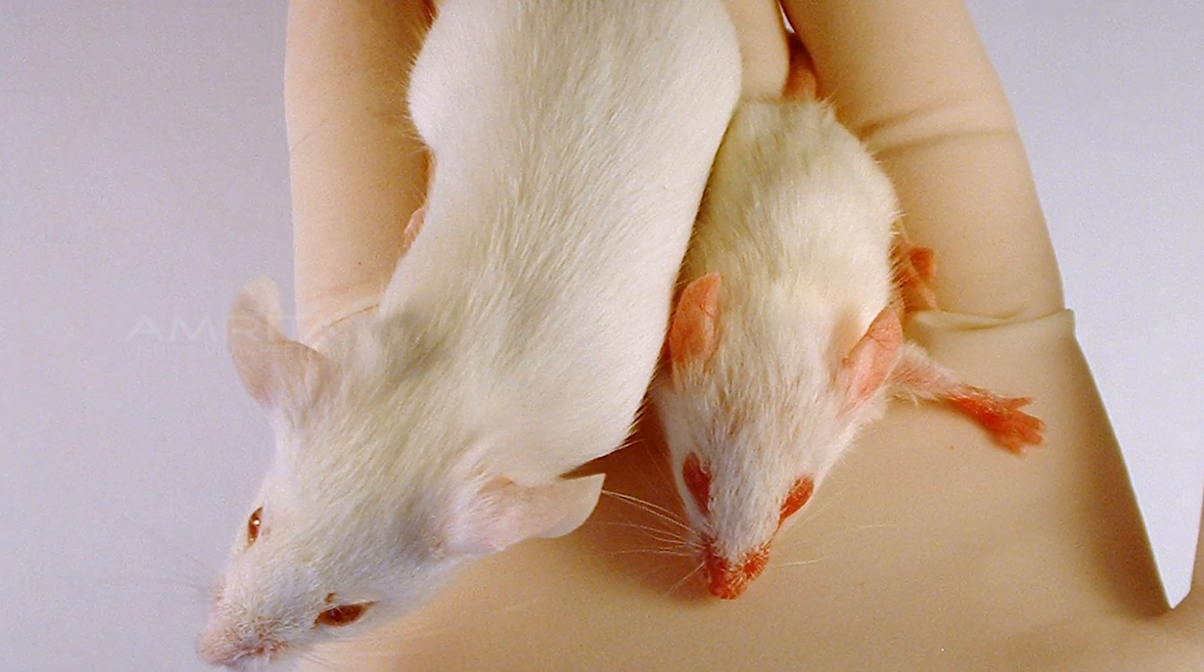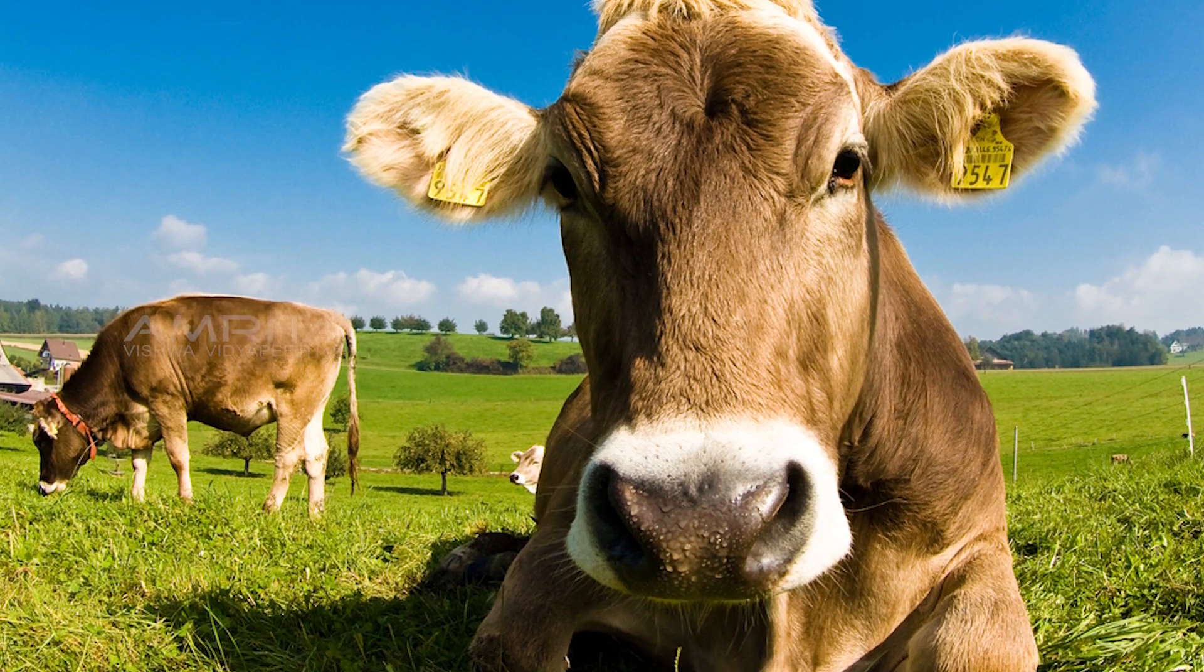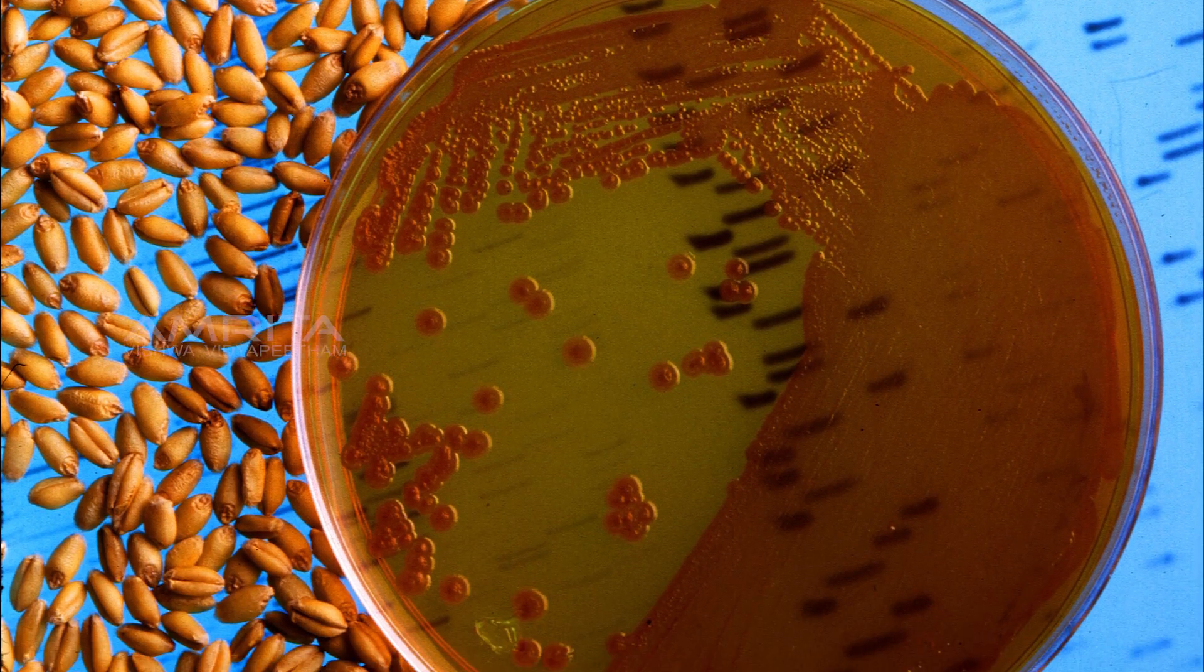Molecular cloning is a technique in genetic engineering involving the insertion of a fragment of foreign DNA into a vector capable of replicating autonomously in a host cell.